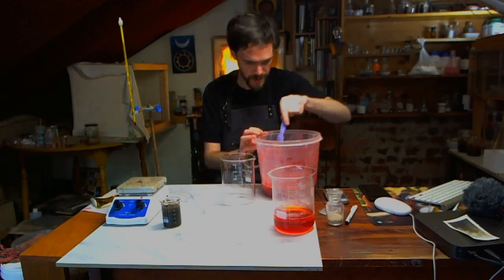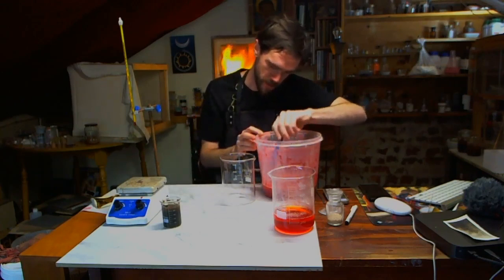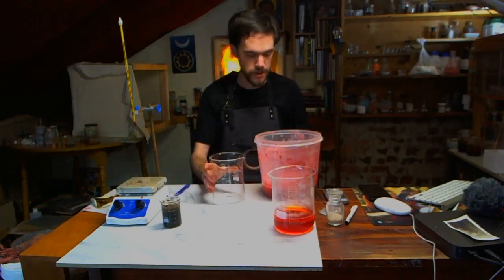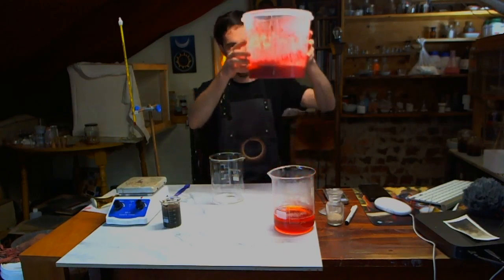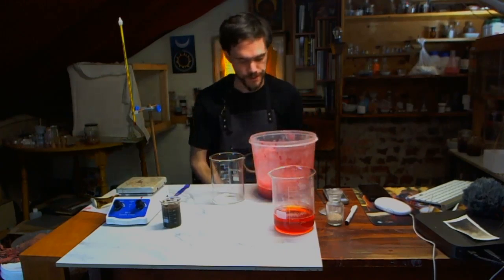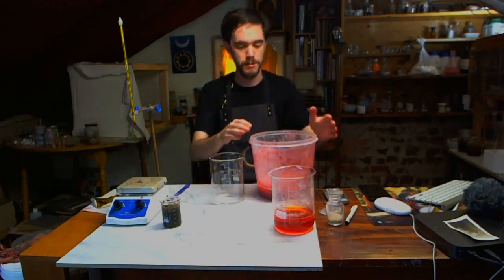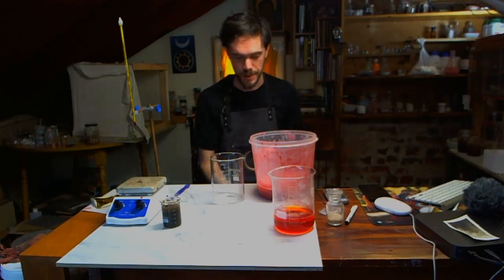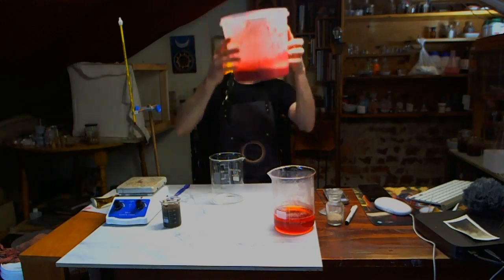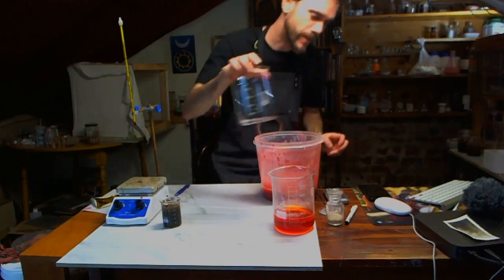So a bunch of the pigment has actually started drying on the walls of the container here, so that's always fun. But what I think I'll do, I'm just wondering whether I should gravity filter this or vacuum filter it. If I gravity filter it, it'll be through a cloth. And if I vacuum filter, it'll be through the vacuum. I'm not sure if it's too much to vacuum filter and take too long, or I don't know. Let's vacuum filter it. That might be the way to go.